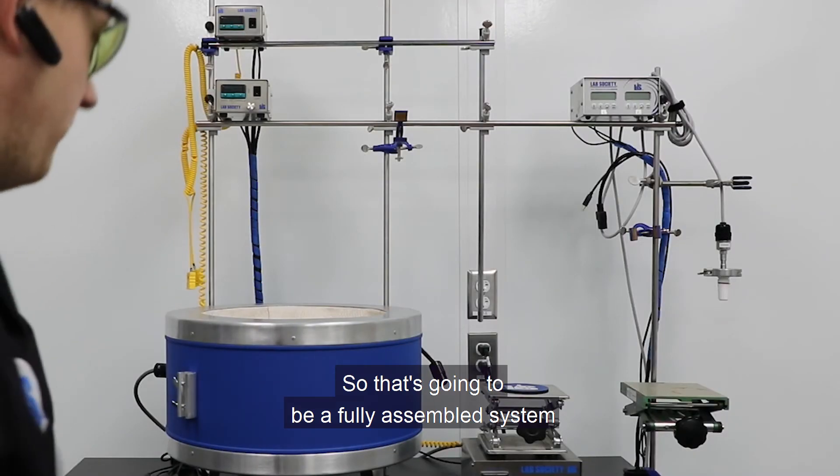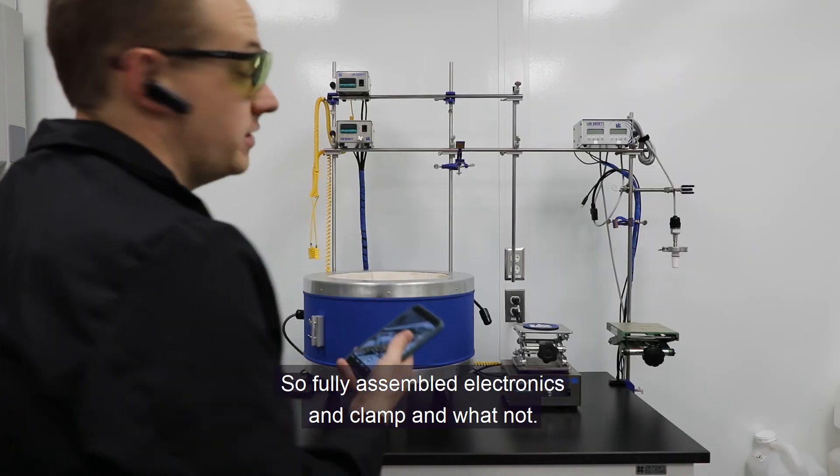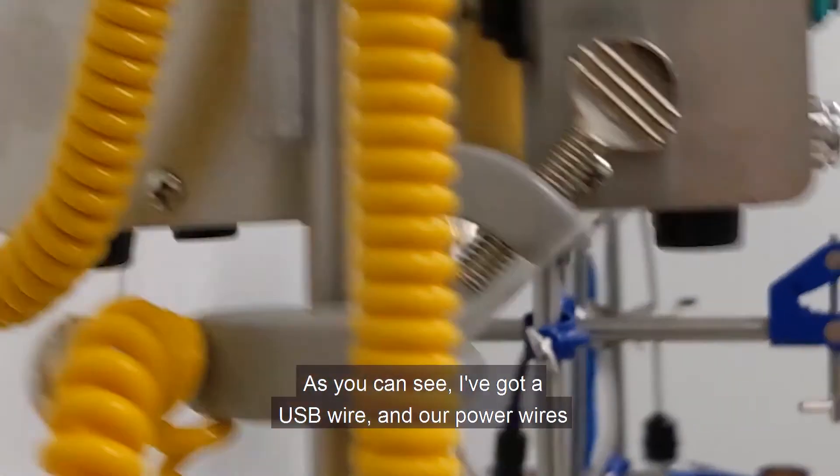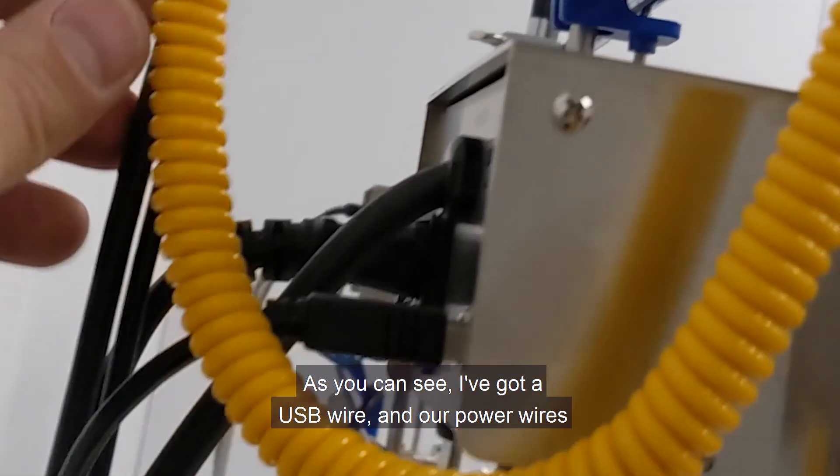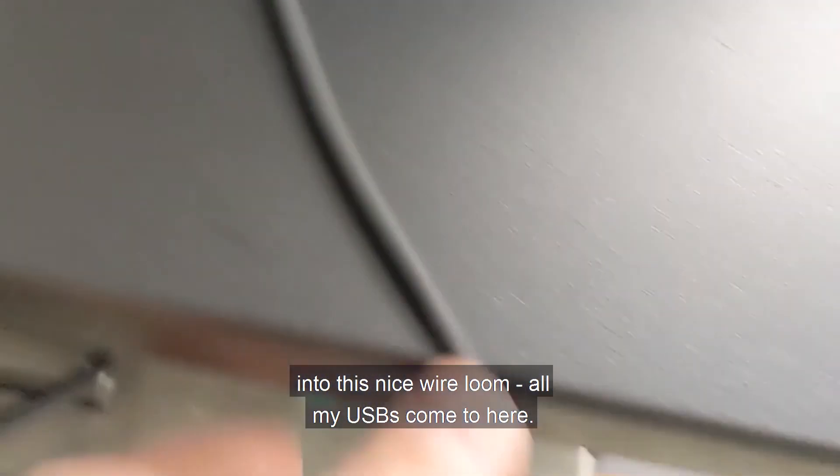All right, so that's going to be a fully assembled system with all electronics only, of course. So fully assembled electronics and clamps and whatnot. So as you can see, I've got my USB wires and my power wires coming up with this nice wire loom. All my USBs come to here.